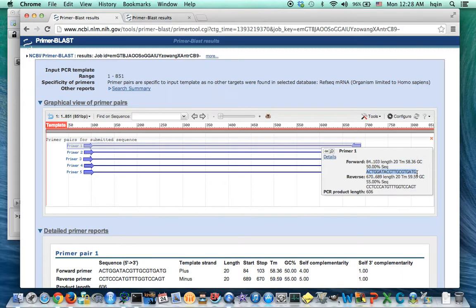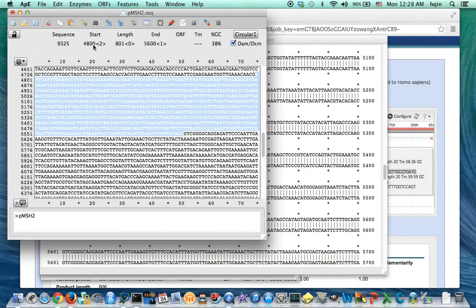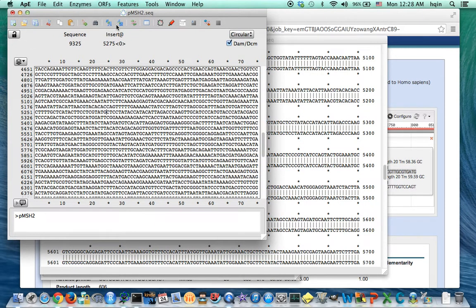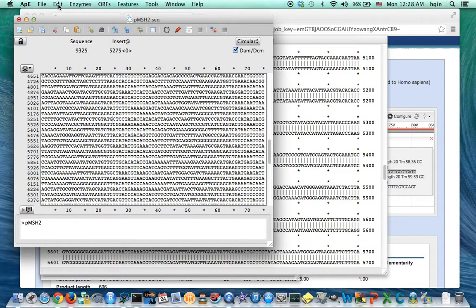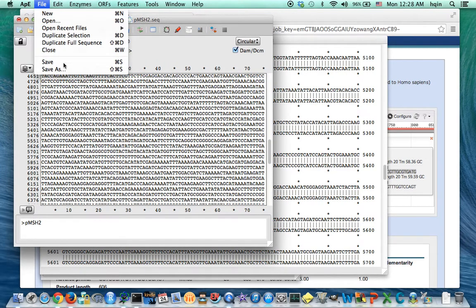So I highlight, copy, and then go back to APE. Now remember, this is the circular plasmid. So I'm going to go to find.